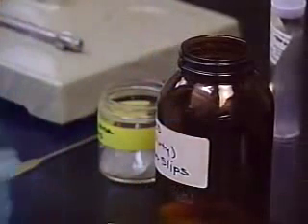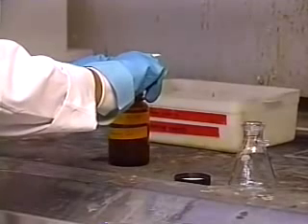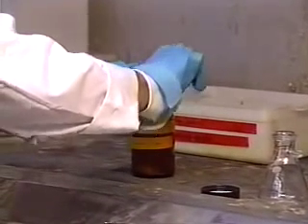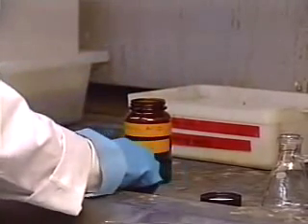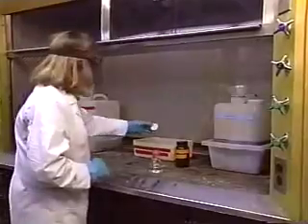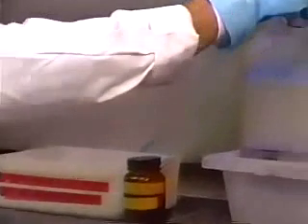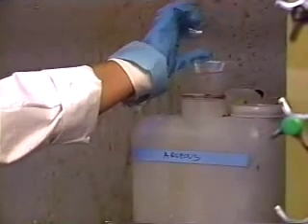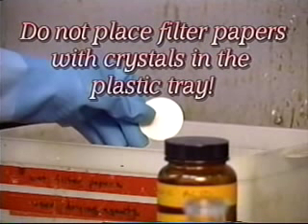When you're finished, place the used cover slips or capillary tubes in the proper container. Place your purified crystals in the recovery jar. Place the wet filter papers in the plastic tray in the main hood. Place any unused solvents in the waste carboys. Do not place filter papers containing crystals in the plastic tray.